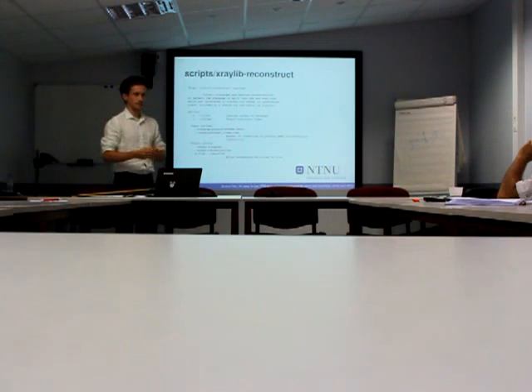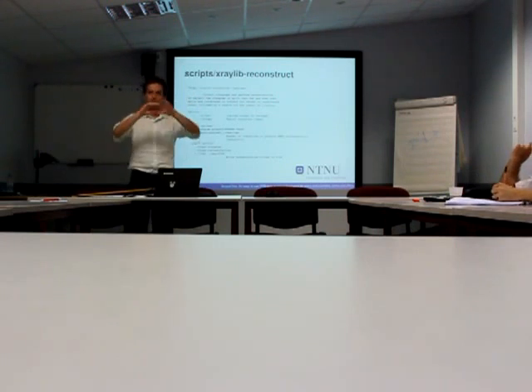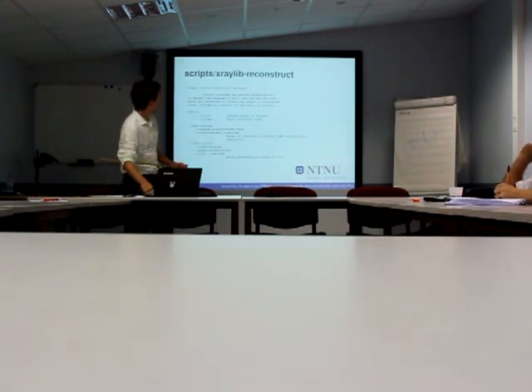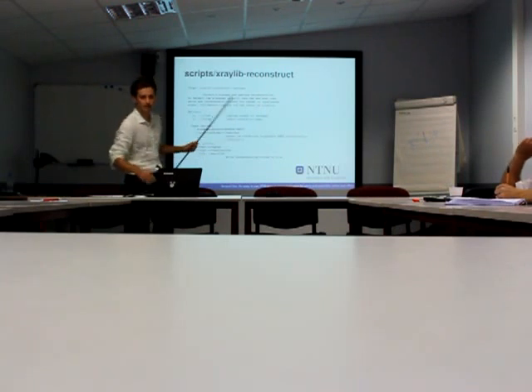So you get this zigzag pattern. So what this script will do for you, it will split the two images and then correlate them and figure out how much you need to shift to make it overlap better. And the same for the center of the sample, it can be refined as well and shifted, which gives less artifact in the final image.